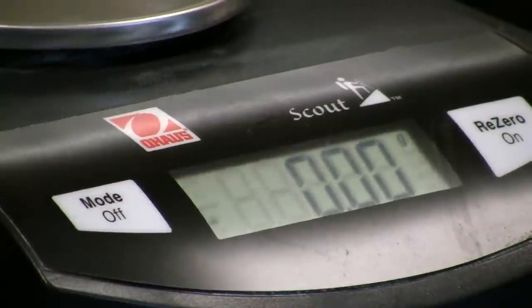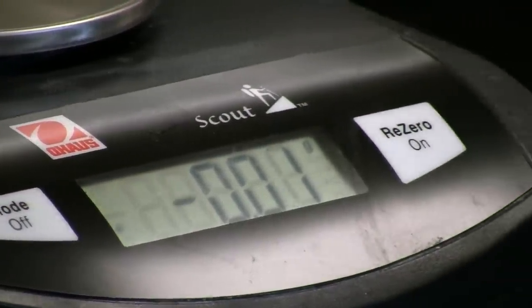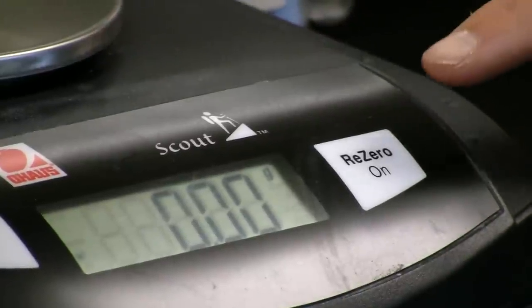The other important button on an electronic balance is the re-zero, or tare button. Pushing this button resets the balance to zero.